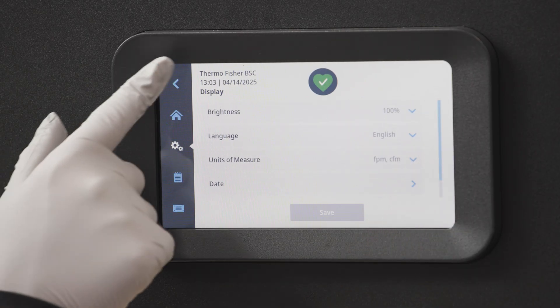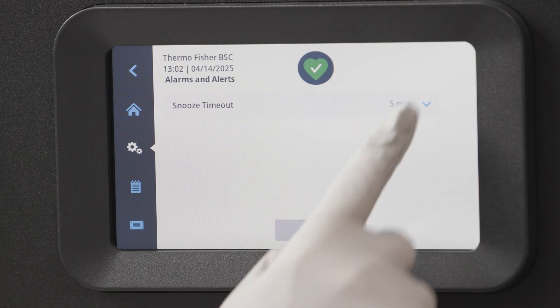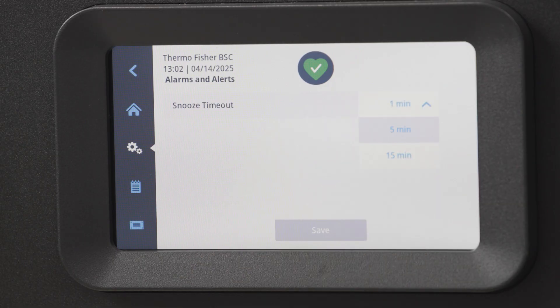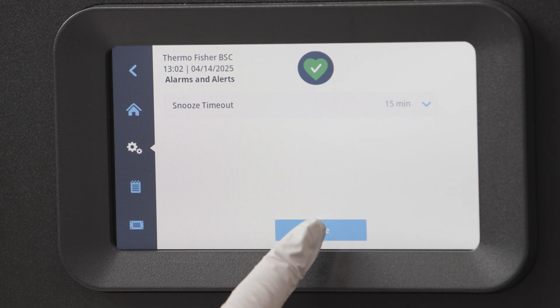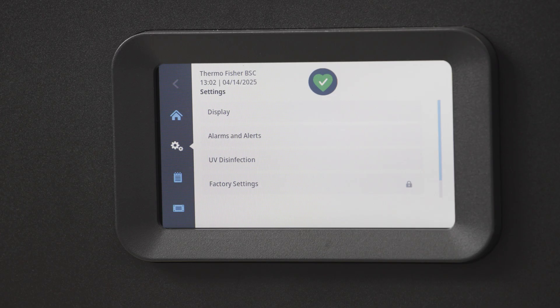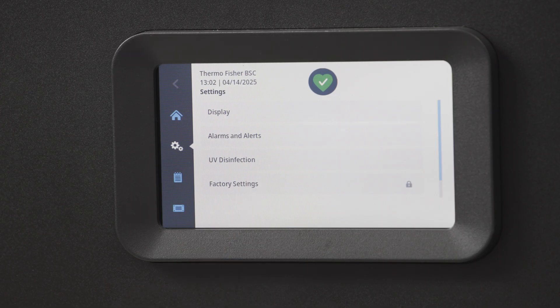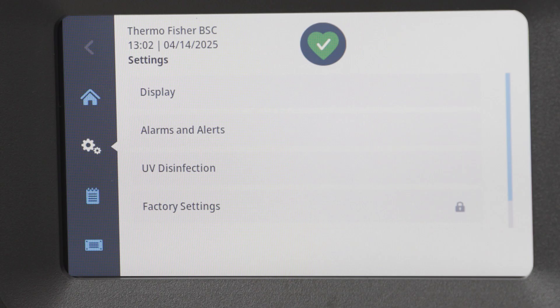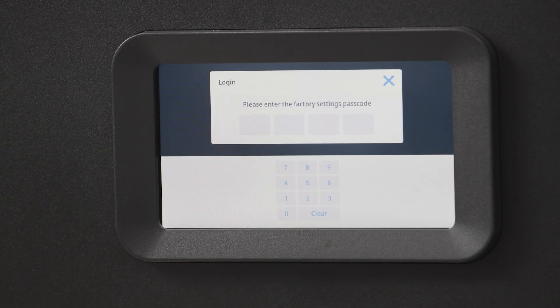Through the alarm and alert setting, you can change the snooze time from 1 to 15 minutes, and finally access areas that require administrator privileges. With proper access, factory setting adjustments can be made from here, and velocity as an alarm can be altered by the field certifier.